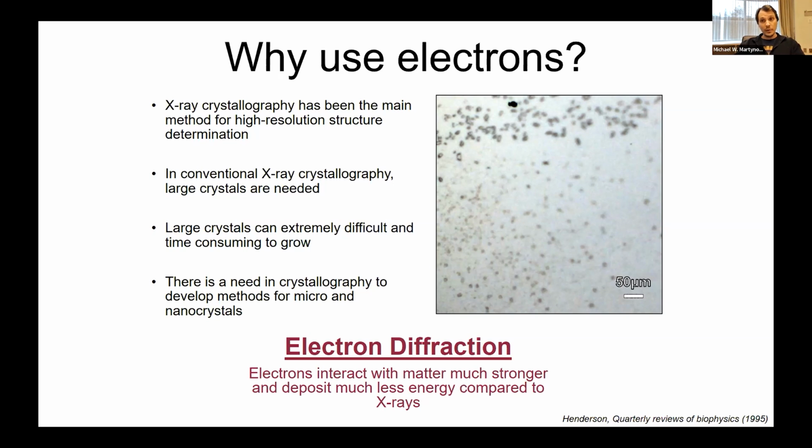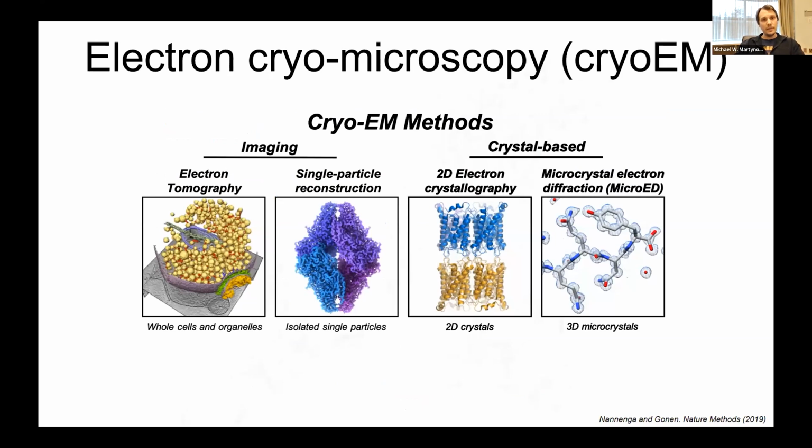So talking about what we do, this is cryo-electron microscopy. In cryoEM, we like to divide what we do in the microscope into two basic camps. That's techniques where you take pictures, where you refocus the scattered electron beam back into an image, and diffraction-based methods, like 4D STEM, where you collect the scattering from the sample, whether it's a crystal or not. Of these, the major techniques nowadays are two-dimensional electron crystallography and micro-ED, which is what we're talking about today, which is microcrystal electron diffraction.